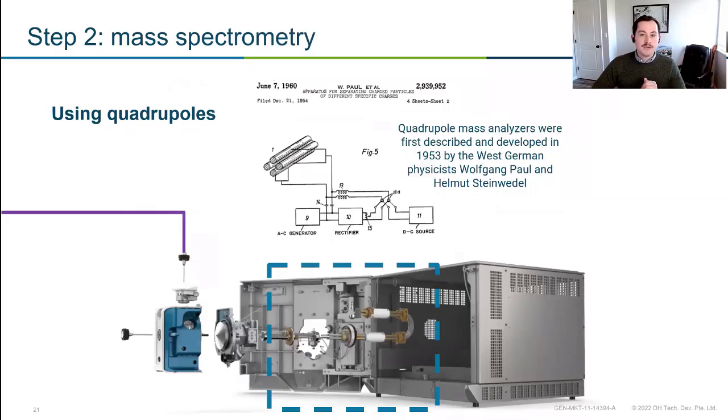But now that we've introduced our analytes, we can really get into the mass spec portion. This is where we get to do the real mass spec.